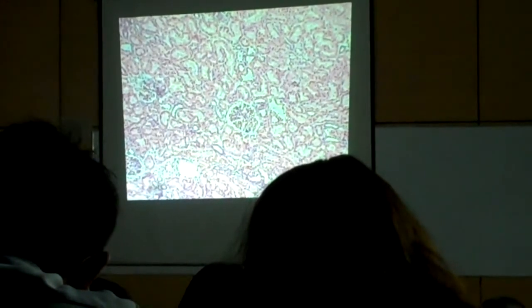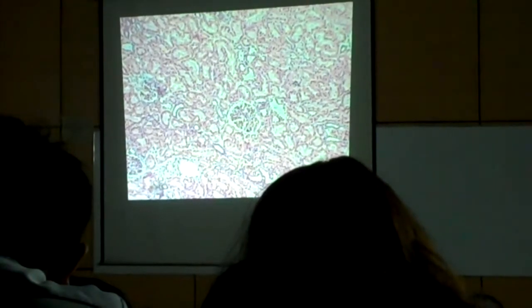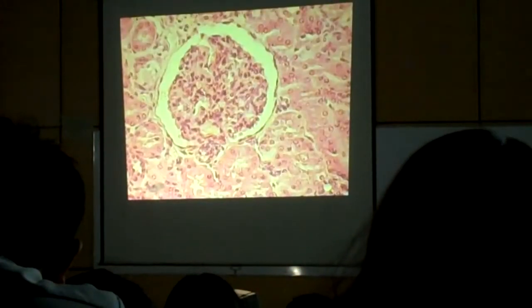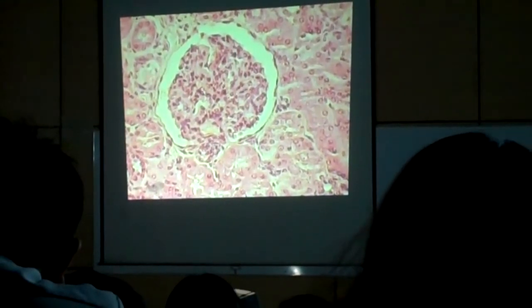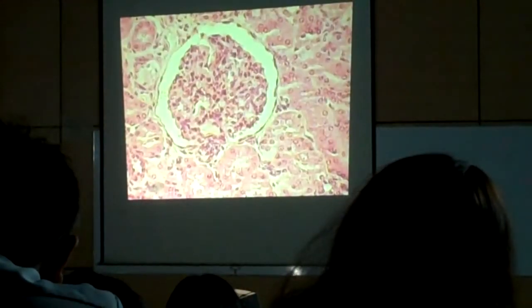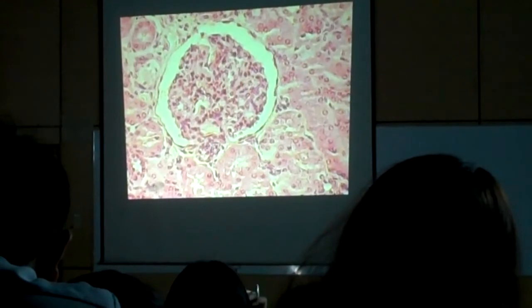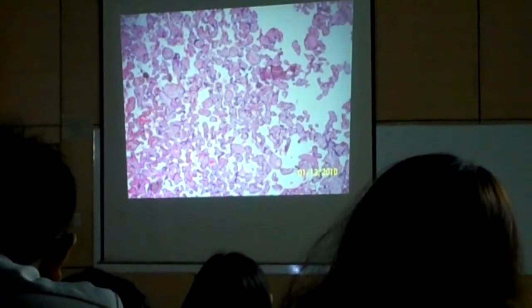Renin and erythropoietin are the most commonly mentioned hormones, but there are still others that come from what organ? Kidney. Okay, so that is the glomerulus, the Bowman's space and the Bowman's capsule. Okay, if you identify the organ, you can also name the hormones. If you can identify the cell, you can also name the hormones.